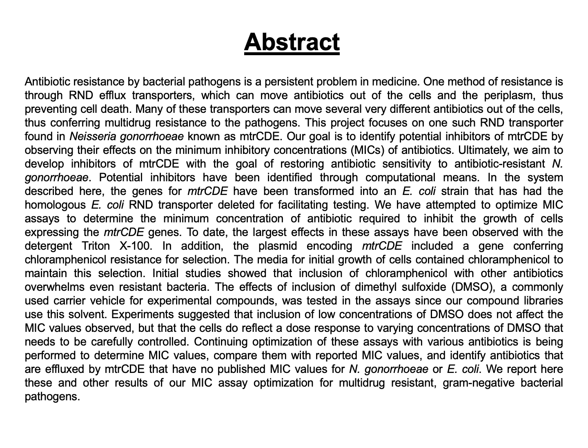The end goal of this project is to identify and develop inhibitors of mtrCDE in order to restore antibiotic sensitivity to antibiotic-resistant Neisseria gonorrhoeae. Potential inhibitors have been identified through computational means. This presentation reports our efforts to optimize minimum inhibitory concentration, or MIC, assays for multidrug-resistant gram-negative bacterial pathogens.